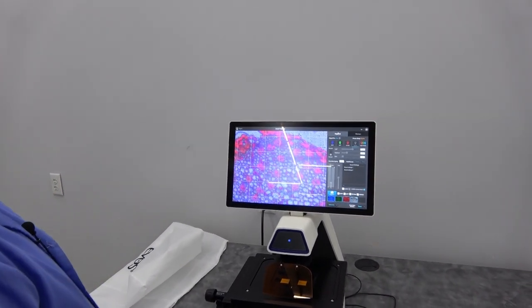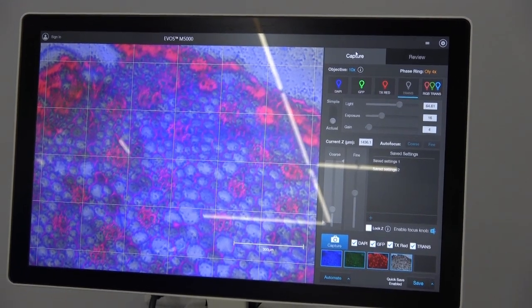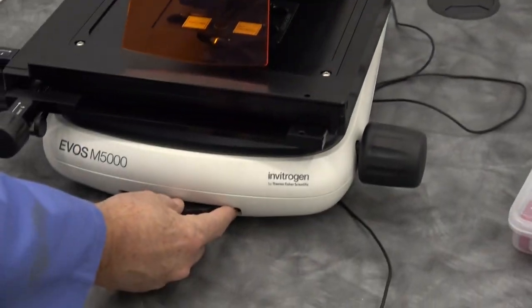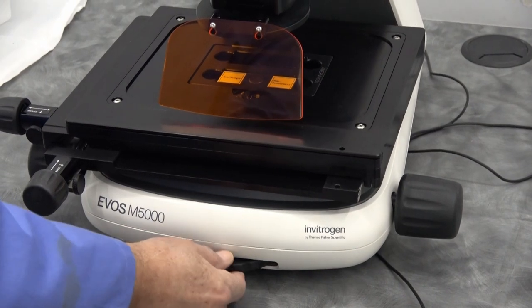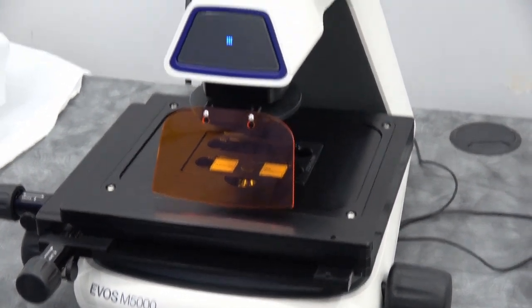There is actually the slide that we have on there right now. To change an objective, your big knob here in the front will allow it to change to your different image.